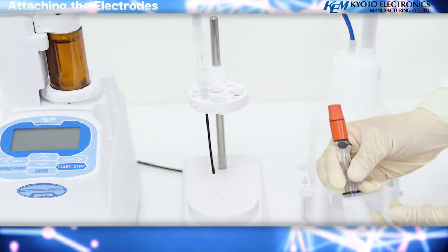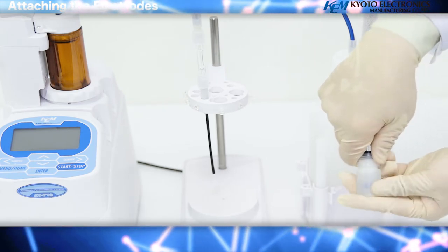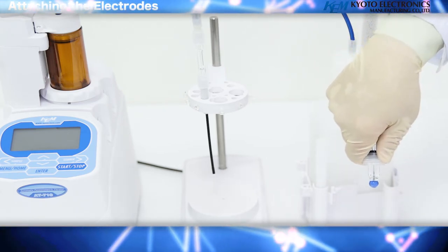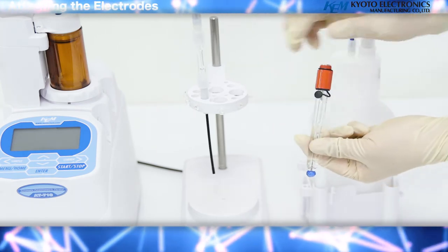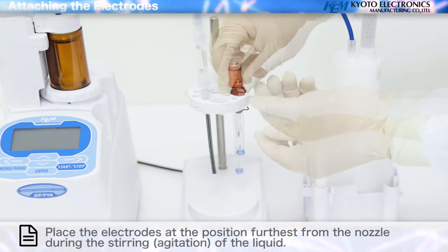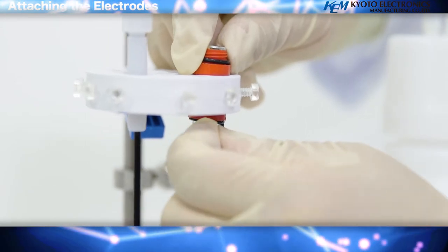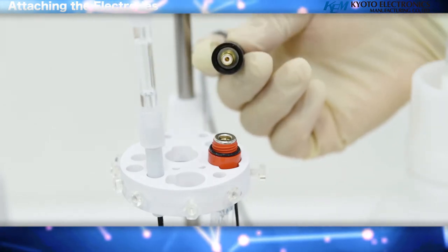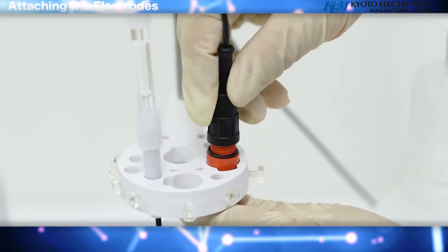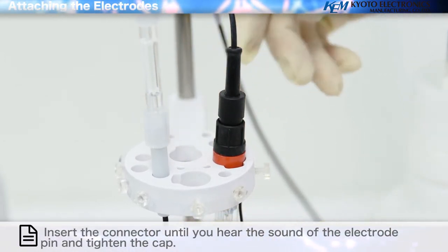Attaching the electrodes: attach each electrode to the electrode holder and tighten the locking screw. Insert the connector until you hear the sound of the electrode pin and tighten the cap. Adjust its vertical position.